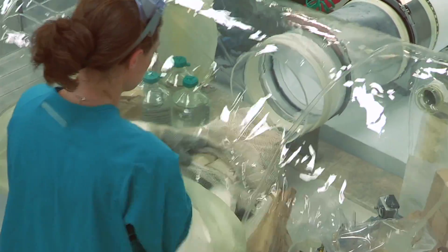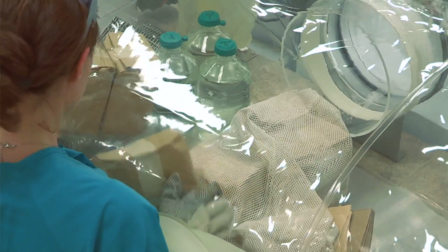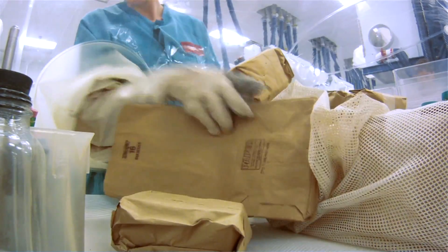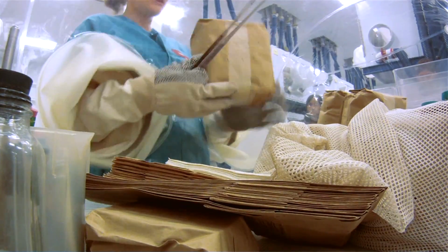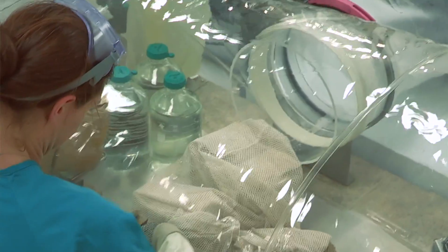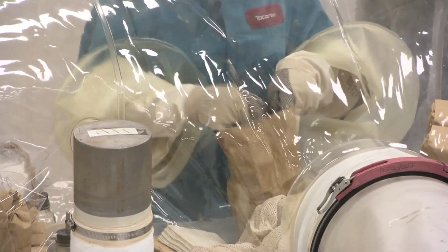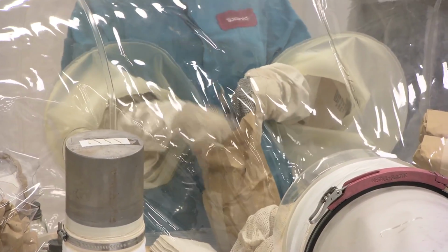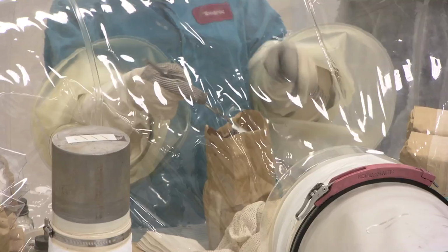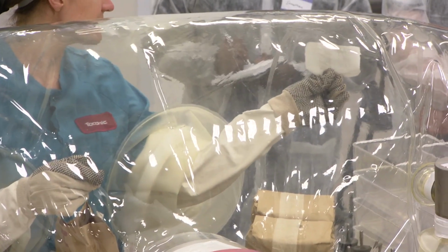Okay, so within your cylinder, there's going to be the test bag. And the test bag has the autoclave tape. It's usually marked with an X. And in here's going to be our gauge. It's usually placed down in towards the center of the bag. And you want to make sure that it's dark in color all the way across into the accept range.